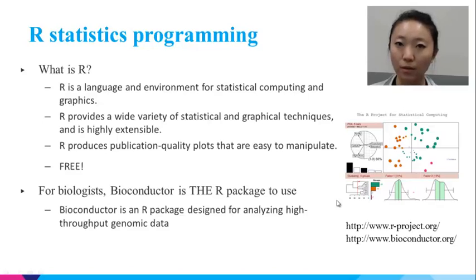However, compared with well-maintained commercial software such as MATLAB and Mathematica, there is no guarantee of the quality of an R package. As a beginner, I suggest using packages that have been frequently used and widely tested, or writing your own function for better control. Fortunately for biologists, we have Bioconductor, which collects R packages performing high-throughput sequencing genomic data analysis with almost all well-established approaches. Several packages will be needed for CummeRbund to be fully functional.